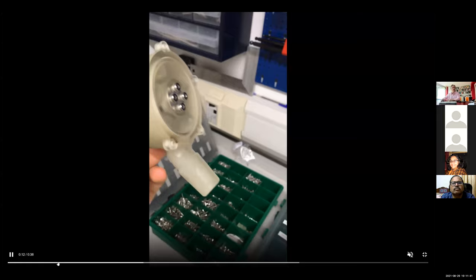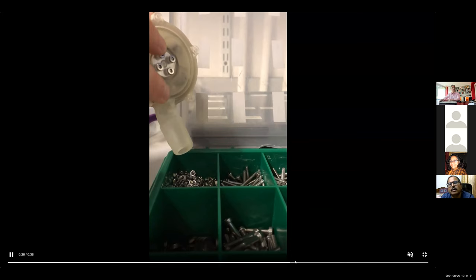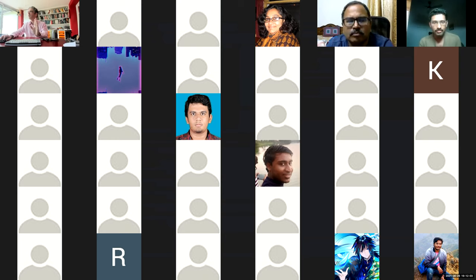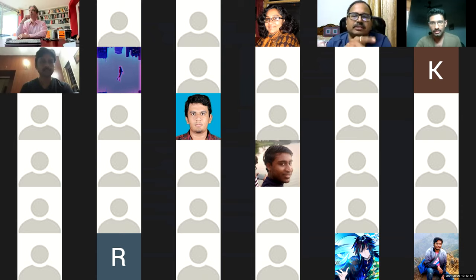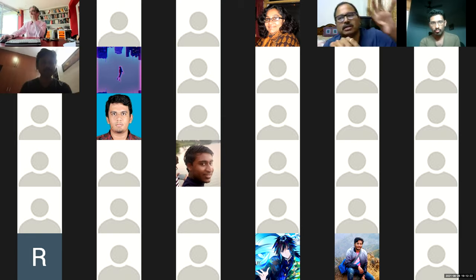Yep. So basically, you can see the items are in, and let's see if you can just rotate it around. So you can see how it works. And I've made another version, which I can't show here because I haven't finished organizing it all, but basically it has a big hopper in the top, and then the wheel rotates around. This is more like what we use for the controlled addition of liquids, the pump. But the hopper type is what we have designed, with a hopper, and then just a screw that rotates. That can be connected to a hopper.